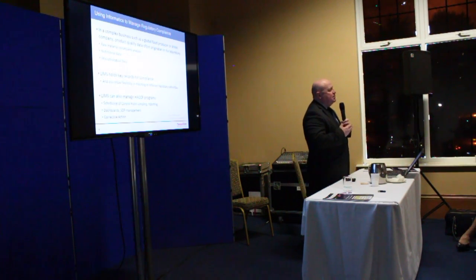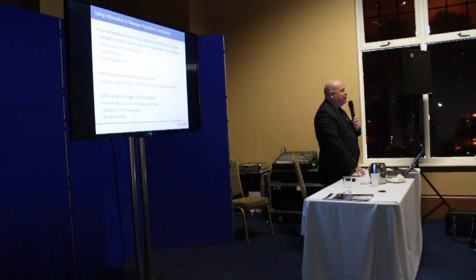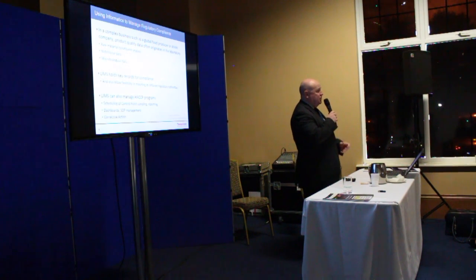So typically, what does a LIMS give you? LIMS is the acronym for Laboratory Information Management System. The raw data, as I said, for micro and chemistry testing is recorded or captured from an instrument. It provides the whole chain of custody on the sample from the point at which it's taken in production to when a quality supervisor signs it off. And so you can show a customer, if you're making for a particular customer to a high spec, that you can trace every result, or you can show it to an auditor if you're working to a certain level of compliance and quoting that compliance with your product.